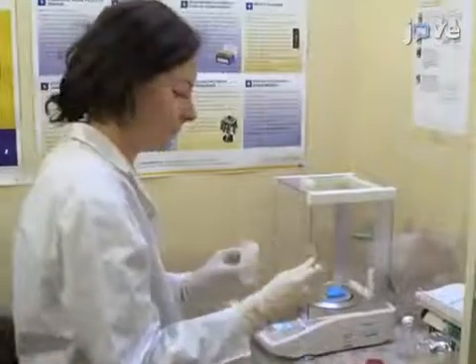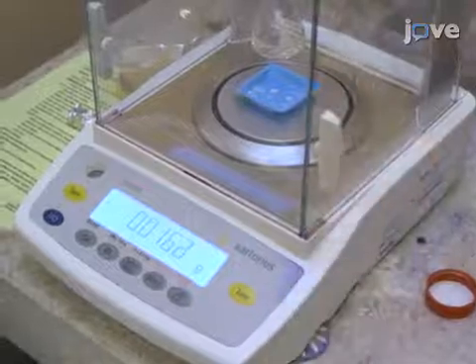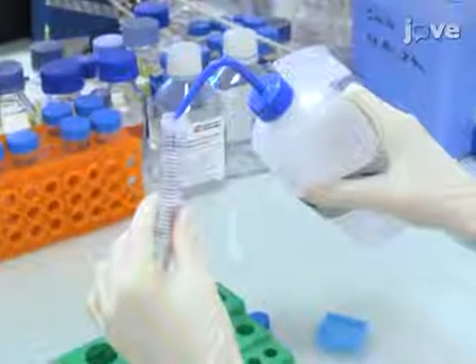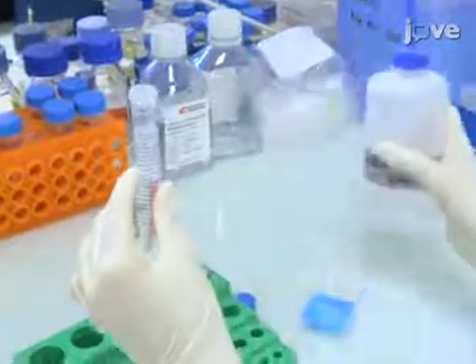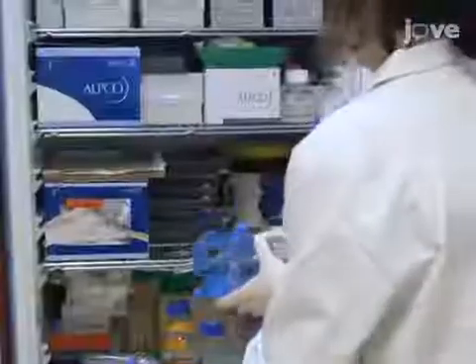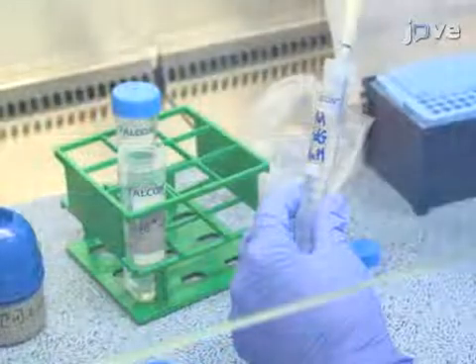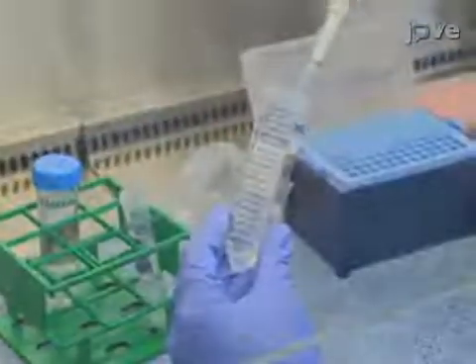To prepare cold 2DG solution, weigh 16.4 milligrams of 2DG and solubilize it in 10 milliliters of distilled water to obtain a 10 millimolar solution. Store the solution at 4 degrees Celsius. Next, add 600 microliters of cold 2DG.